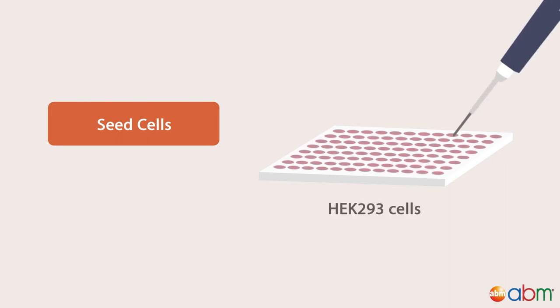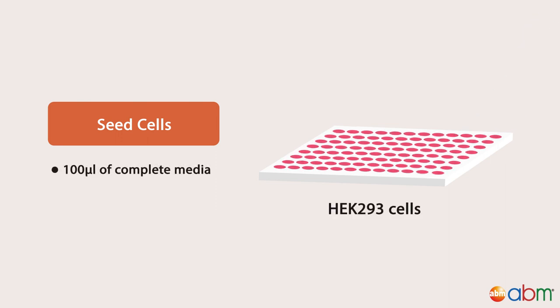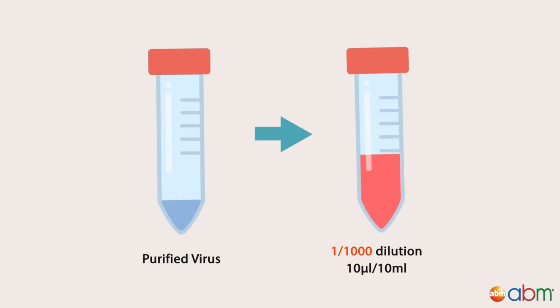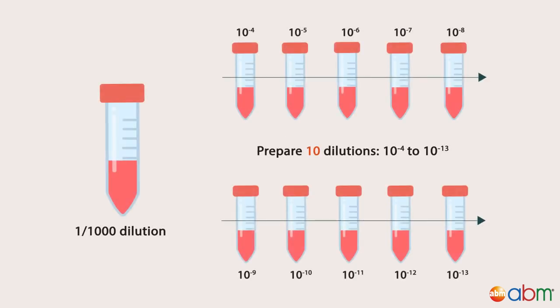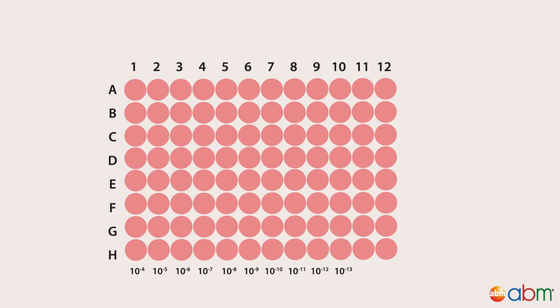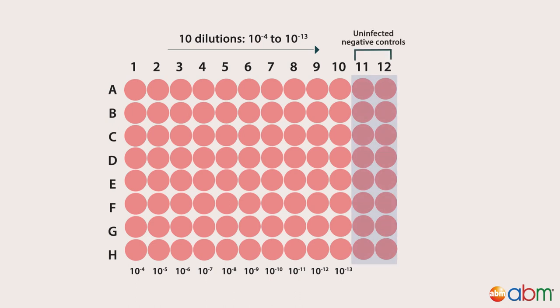Now that you have your purified sample, the last step is to calculate the virus titer. In each well of a 96-well plate, seed 293 cells in 100 microliters of complete media so that they will be 10–20% confluent the next day. The following day, prepare a 1 in 1,000 dilution by diluting 10 microliters of purified adenovirus stock in 10 ml of complete media. Vortex for 5 seconds. Make a series of 10 additional dilutions, each by a factor of 10. Label columns 1–10 of the 96-well plate with the corresponding dilutions, increasing from left to right. The last two columns will serve as uninfected negative controls.